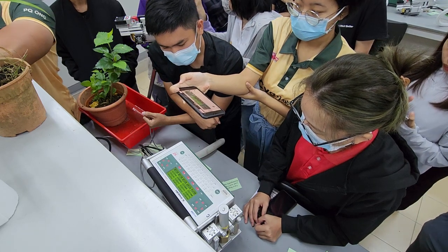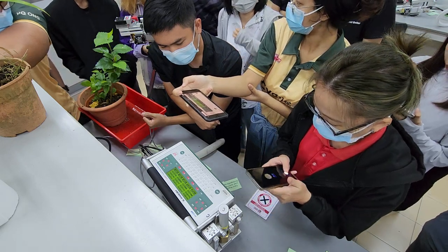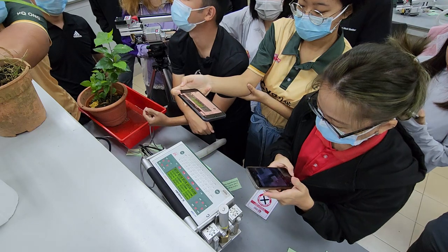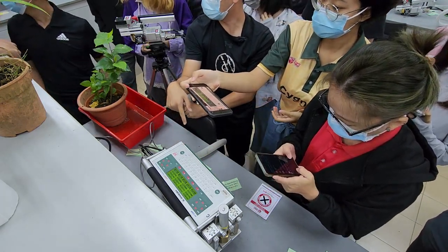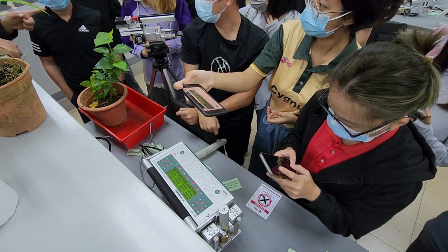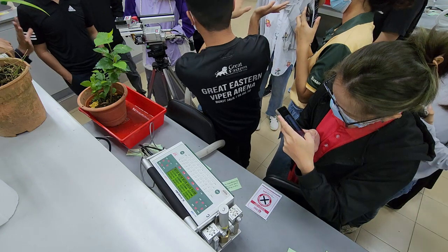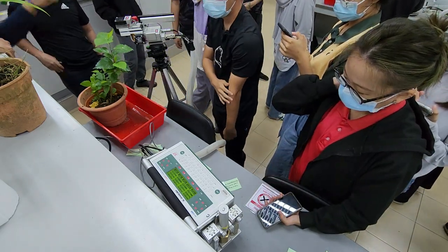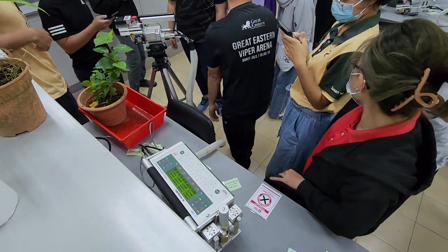Warm up. Yeah. It's warmed up. Okay. Is it okay to start the measurement here? Is it done calibrating? Start with that machine. So some of you can try, redo whatever you have learned here. Do it there. Somebody please watch, make sure that nothing is exploding.